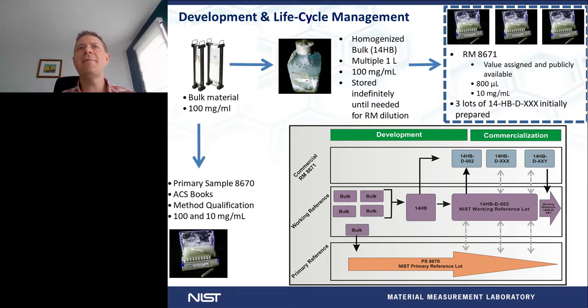Before I get into talking about the qualification of analytical methods and the interlaboratory studies, I wanted to mention something about the life cycle management of this product because it really is unique for a NIST reference material. Although it's modeled after a biopharmaceutical development program, it is unique in that we need to make sure this material is available with the same attributes for the long term. In the upper left-hand corner, you can see the bulk material that we received. This is the bulk NISTmAb material, 100 mg per mL. We diluted one lot of this material to make our primary sample. So this is our in-house primary standard material and also our collaboration material.